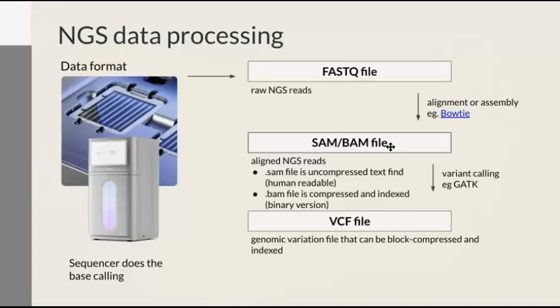So do you want to look at transcription? Do you want to look at variant calling, for example? So let's say you want to look at variant calling. You want to see the difference between person A, person B, and person C, and you want to be able to look at a certain region to decide how often you see gene X, different versions of that gene X. So you could do something called variant calling. So let's go into these in a little bit more detail.